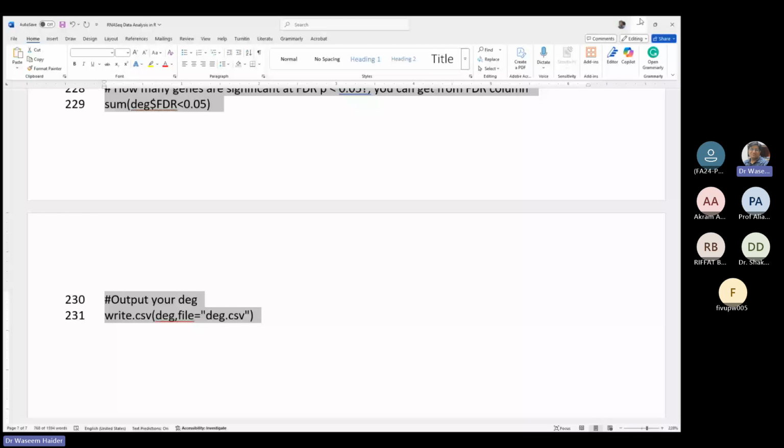That's what we used to do in the previous sessions or classes. But today, we go here, new script, right?